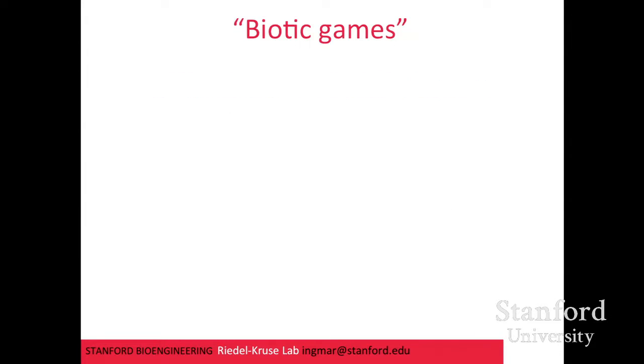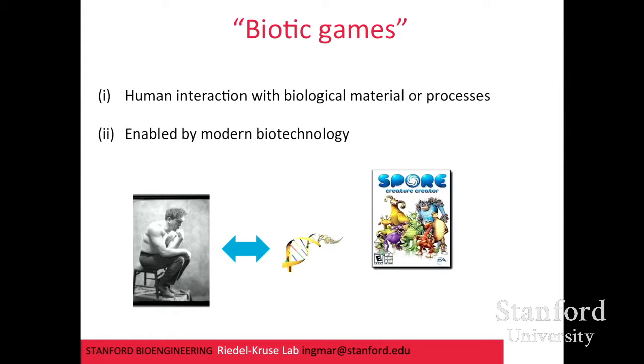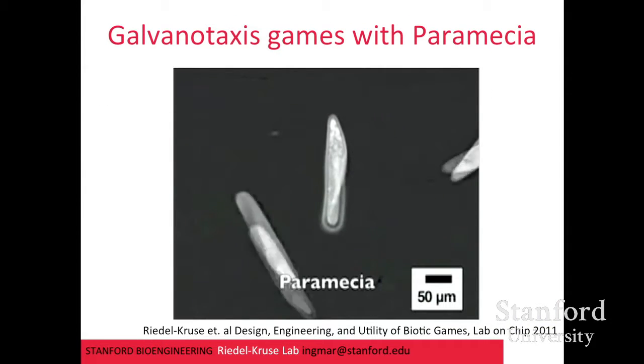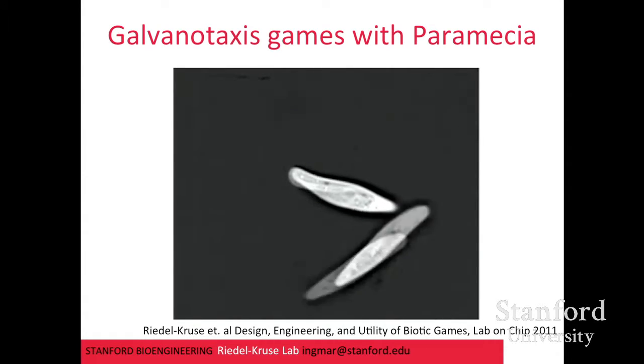The idea is what we call biotic games: could we make games where a human can interact with a biological process or material, and this really has something to do with modern biotechnology. If it's a pure emulation or pure simulation, that's not what I mean. And I also don't mean something macroscopic like horse polo, which is maybe more ancient biotechnology. That's not what we're interested in. We're really thinking about something microscopic and relying more on modern technology. And what you see here is one of our first projects that shows the paradigm as such.